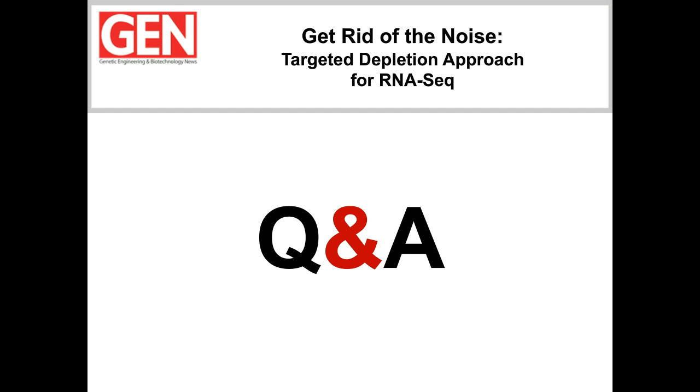If any users have more specific questions about compatibility or more details about the ratios that solo can be pooled with non-solo libraries, again, you can contact our tech support and they'll be happy to help you.